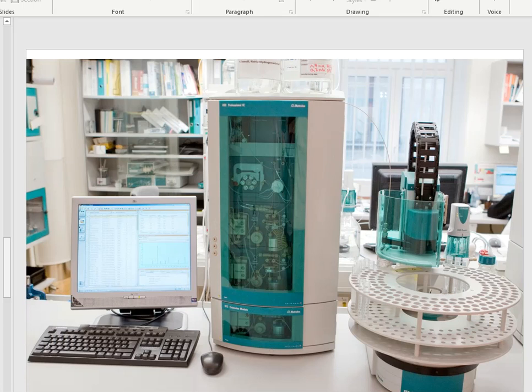So that's really what I want to talk about in this video. I don't want to go into any more detail. I'm going to stop it here. That's a good introduction and lead up to where we need to be when we talk about the theory of the IC system. So a little bit of history about how all of this technology came into play, what it was used for, why people decided to create it in the first place, and that led us up into today's model, which really is kind of a staple for any laboratory now.